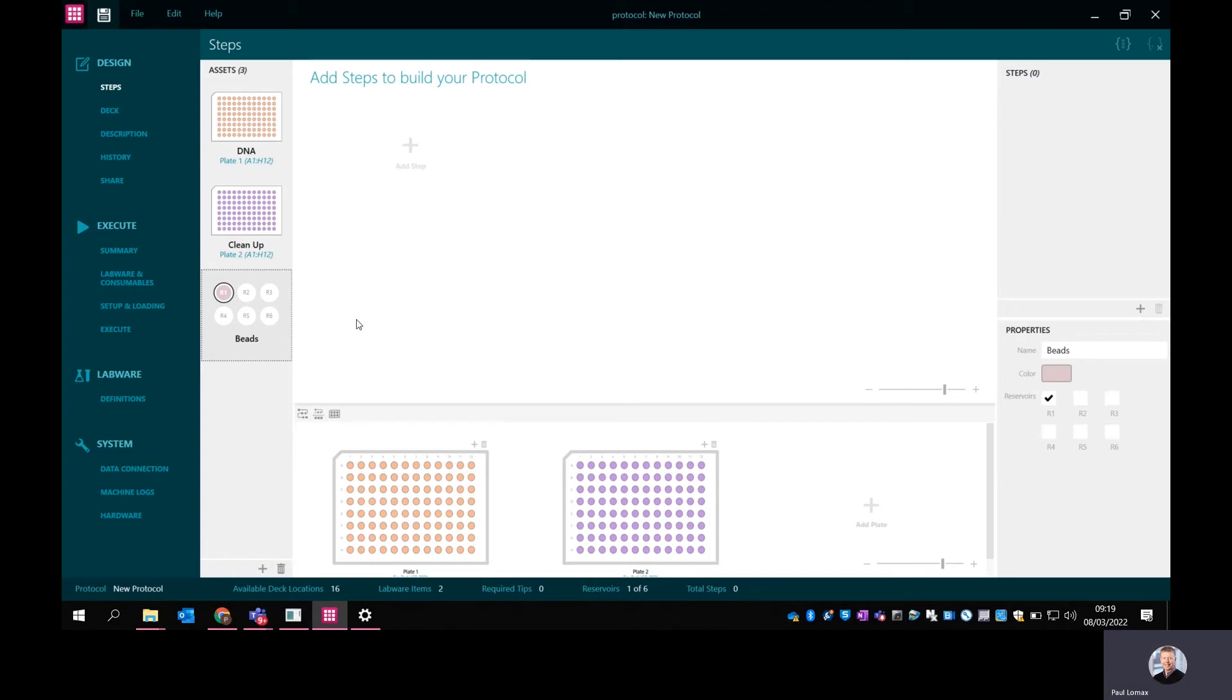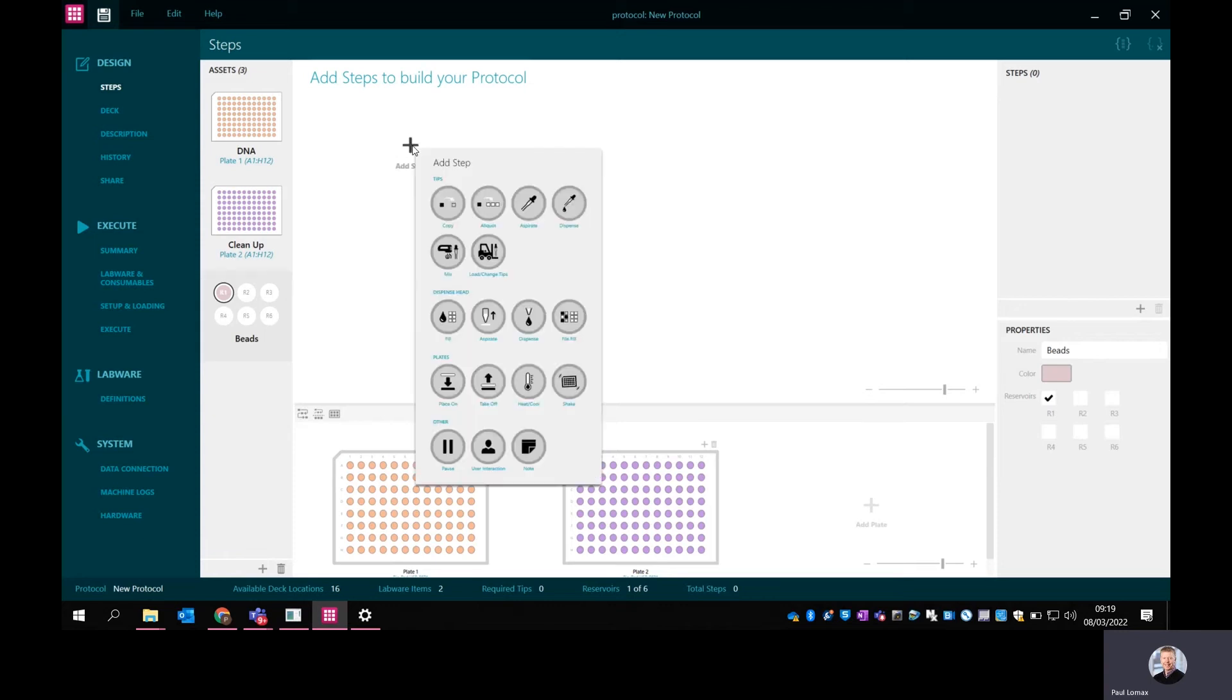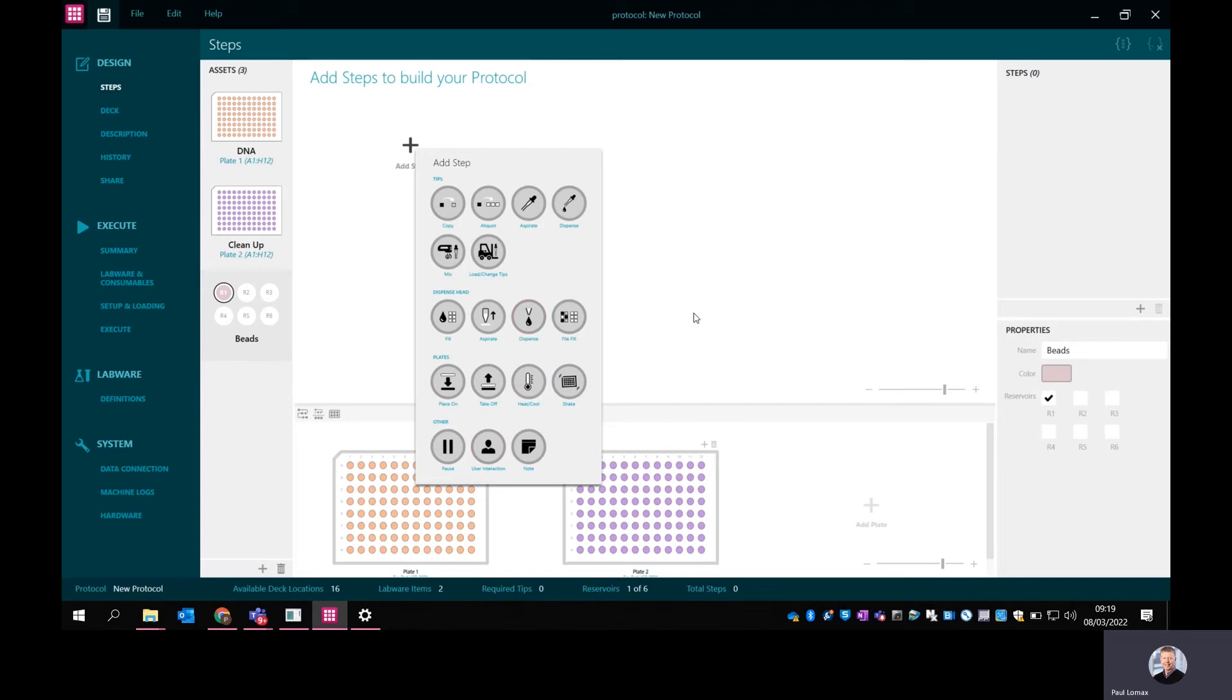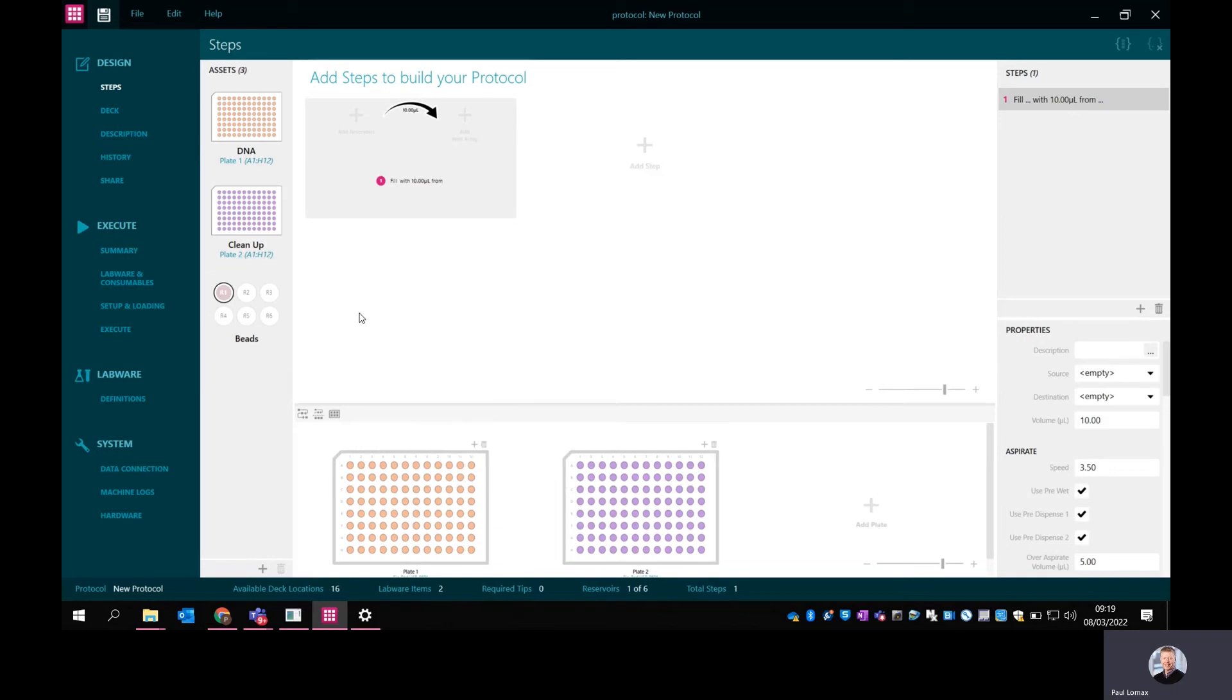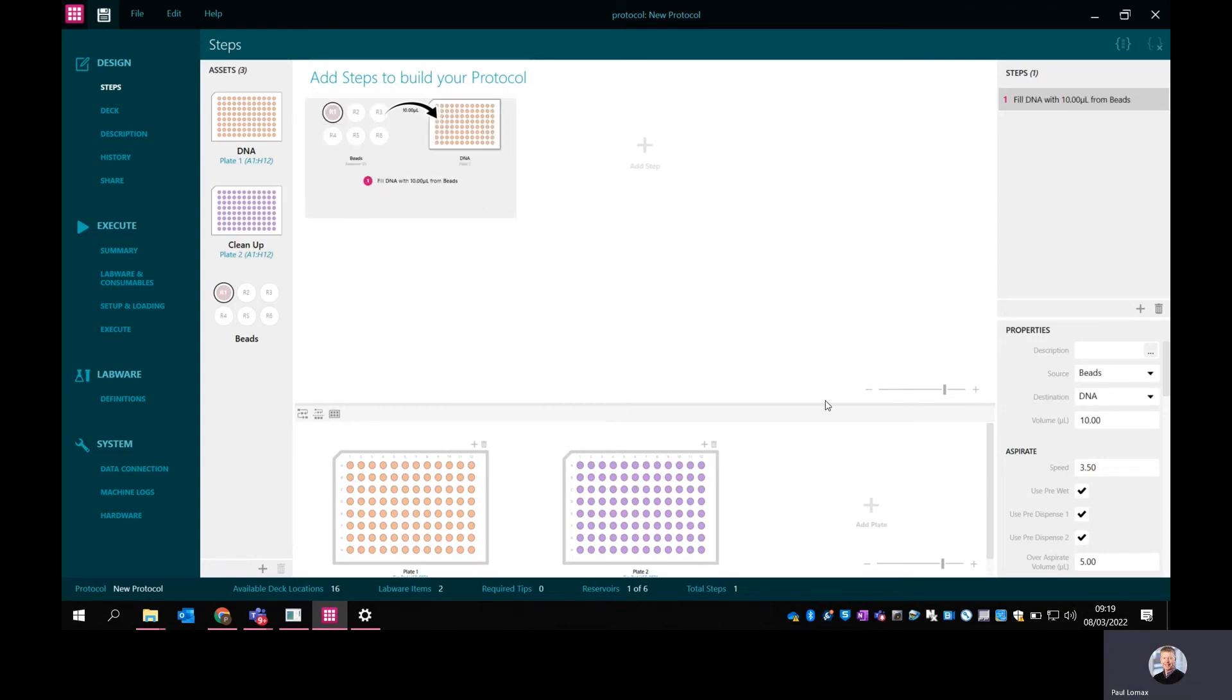I've now got the initial things I need to start the process. I'm going to add a step by clicking up here on the add step function, and that brings up the different modes of operation. At the top we've got pipetting modes, then dispensing modes, things for moving plates into incubators, shakers, and other such as pause and user interactions. It's quite a simple menu to follow. Here I want to use the dispense head, so I'm going to use the fill function which transfers across a whole plate. I'm going from this reservoir into the DNA plate. I'll simply drag and drop them in. There's a default volume of 10 microliters - I'm going to increase that to 20.